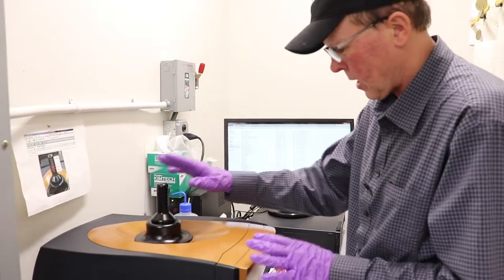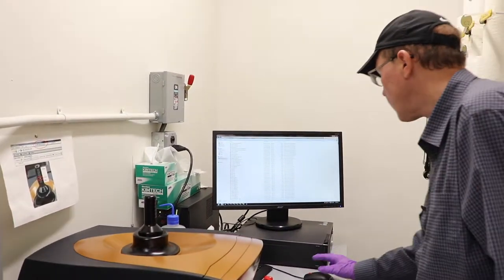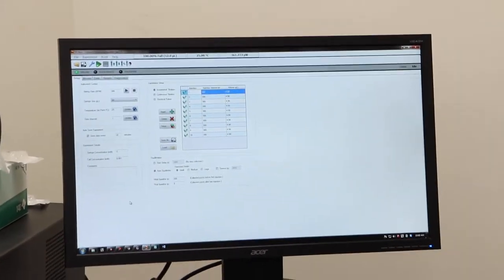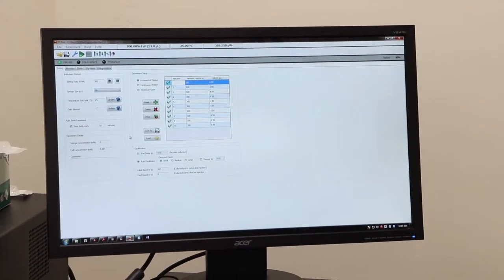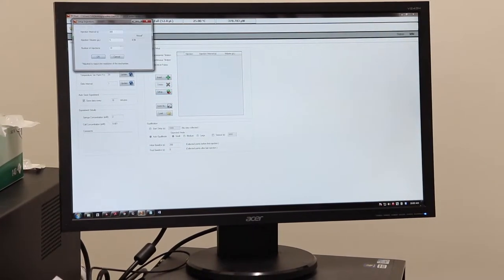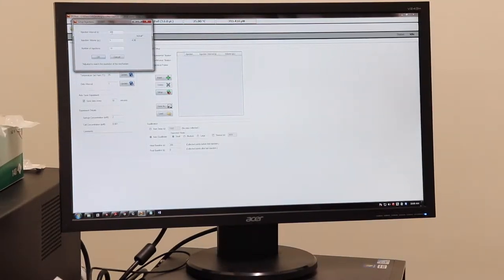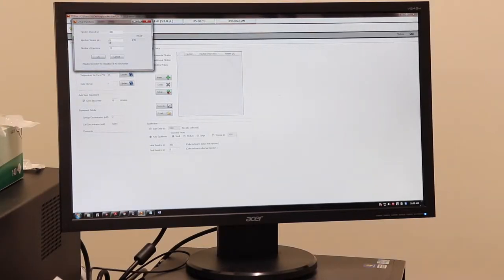Okay, so once that's in place, we're good to go. So we'll go over to our ITC run software. Okay, so we'll go into the setup, which is here. And that's going to ask you the injection interval, injection volume, and number of injections. So for the water-water, it's 300 seconds in between each one, five microliters. It converts it to, for the analysis, it's actually 4.99 microliters. That's a minor detail. And 10 injections. So, okay.